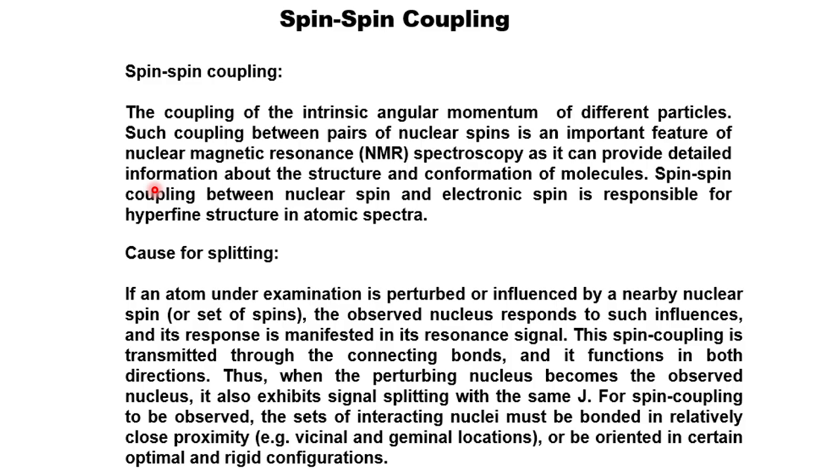And when it is interacting, there will be a change in the magnetic field being experienced. So that's why such coupling between pairs of nuclear spins is very important in NMR spectroscopy, as it can provide detailed information about the structure and also the geometrical conformation of molecules.